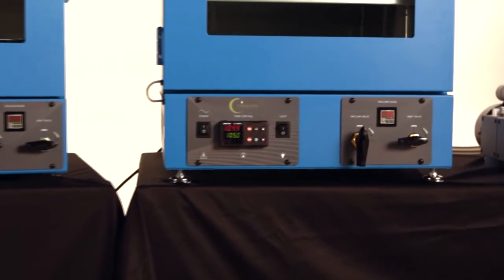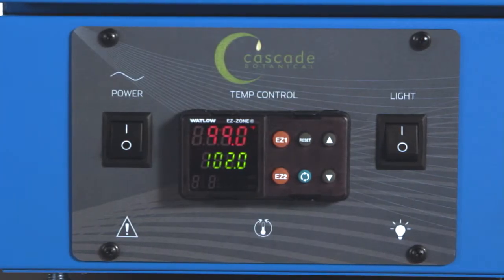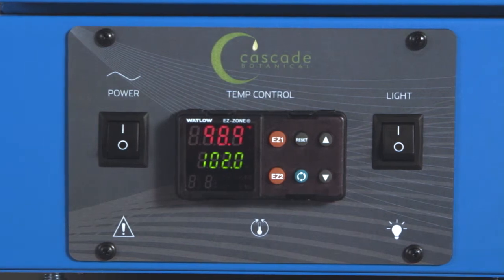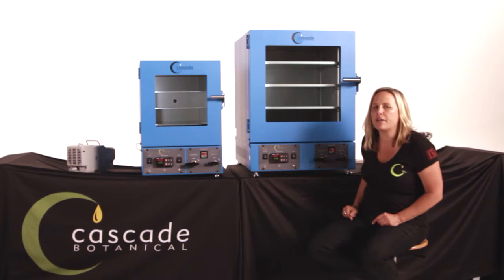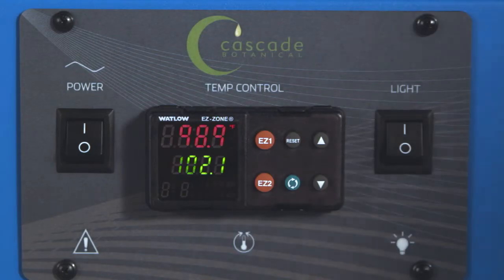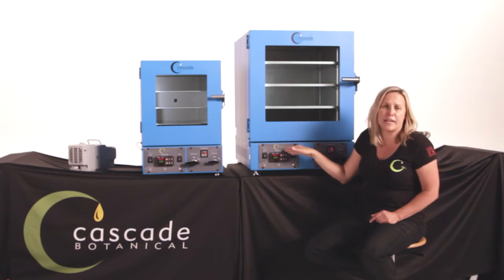On the front control panel, we have integrated the overtemp protection device into the main controller itself, and we've set it to 150 degrees Fahrenheit at the factory. This overtemp protection device is FM rated — that is the gold standard in overprotection device certifications.